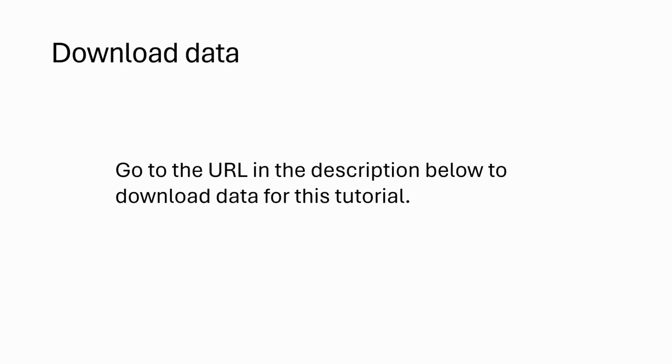Okay, so we are done with installing things. Our next step is to download some data to process.